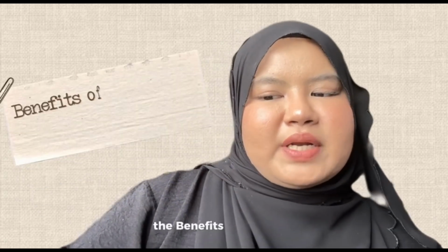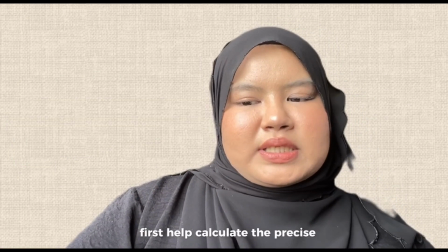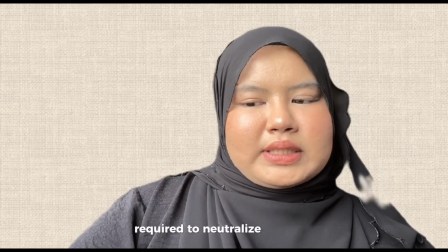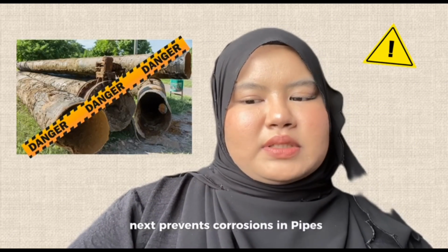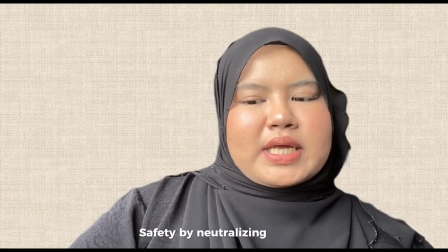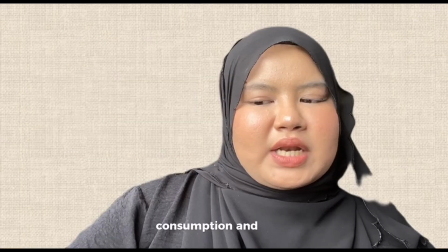Lastly, the benefits of acid-base titration in water treatment. First, it helps calculate the precise amount of chemicals required to neutralize the water. Next, it prevents corrosion in pipes and other infrastructure. It also ensures safety by neutralizing harmful contaminants, making water safer for consumption and use in industrial processes.